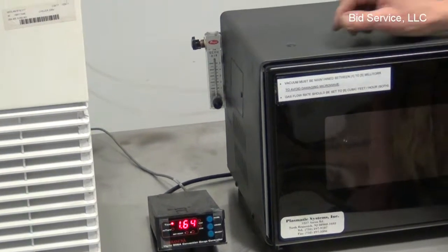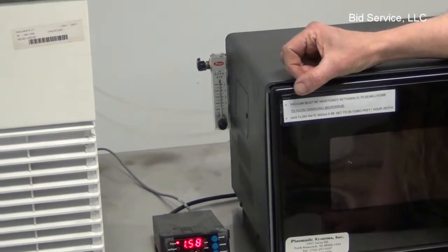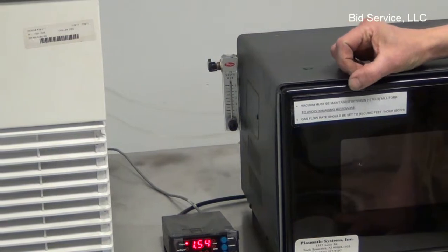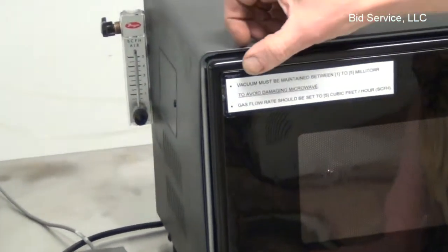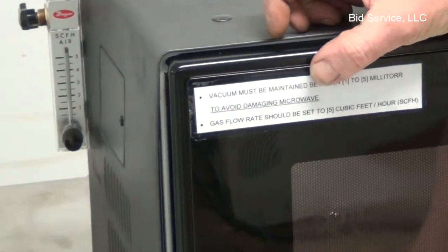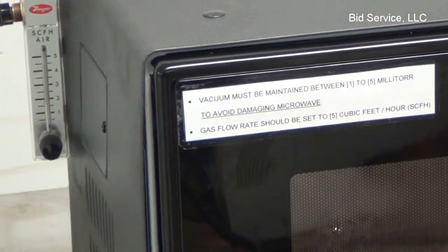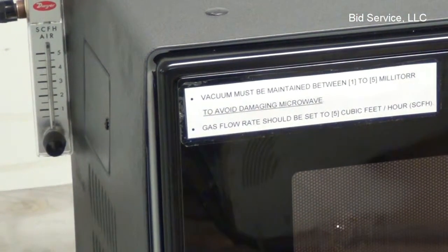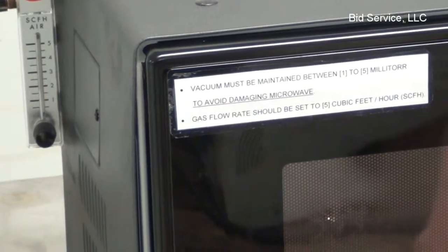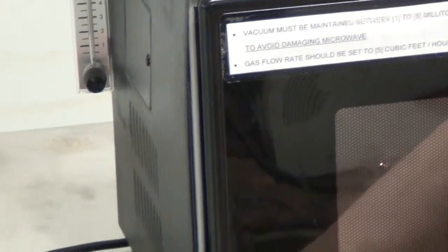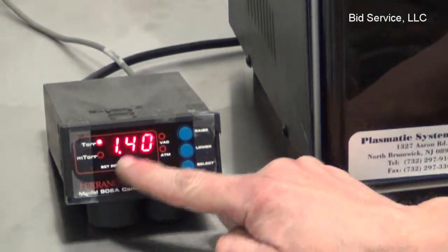Very important: vacuum must be maintained between 1 to 5 millitorr in order to avoid damaging the microwaves. That's very important. So when you are actually exciting a plasma and using it as a plasma etch piece of equipment, you must maintain a vacuum level of between 1 to 5.